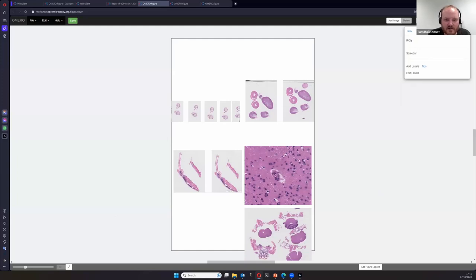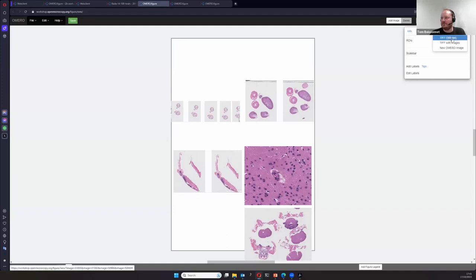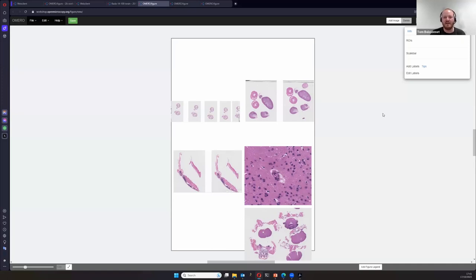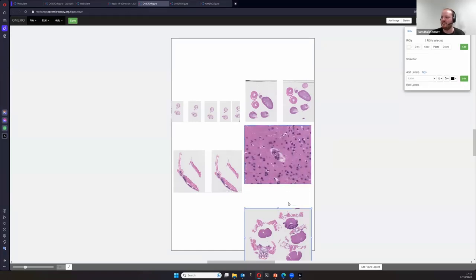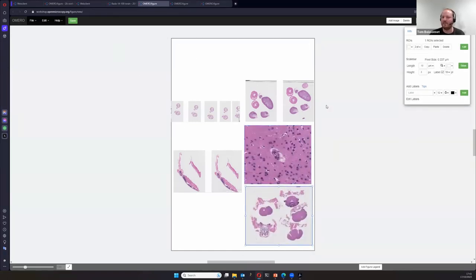When you export PDF or TIFF, you have the downscaled image of such a high-resolution image embedded. At the moment it generates the image, it computes the right resolution to display — TIFF at 300 DPI, which is normally the resolution required for publication. The SVG file inside will have sub-resolution in pixels if you zoom in, so you should adapt your images to the canvas size you want. By default it's an A4 page. If you need bigger resolution for larger printing, change the canvas size so that when you export, it's at 300 DPI for the right size.